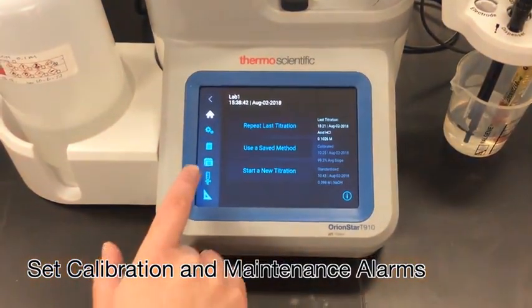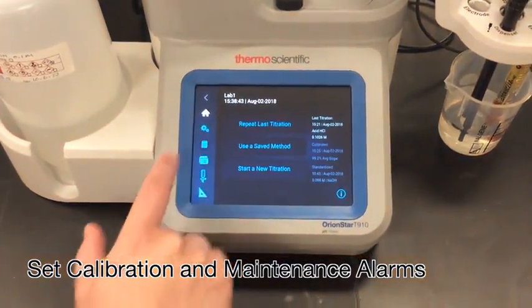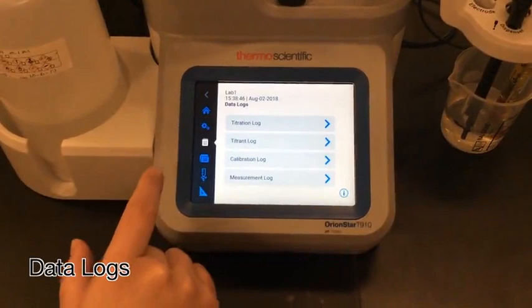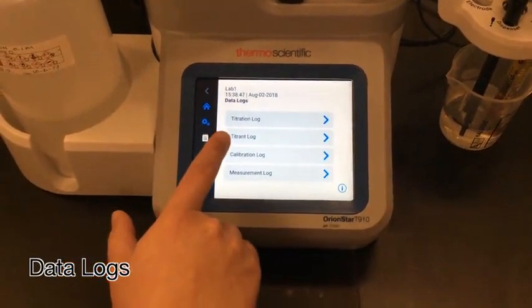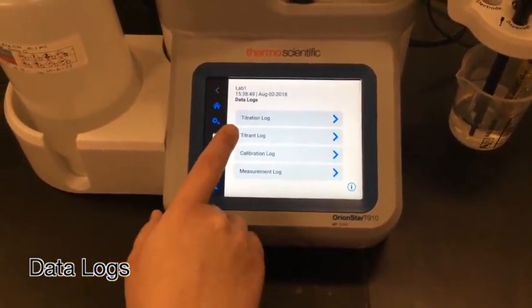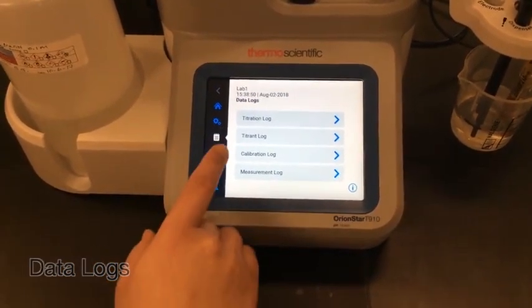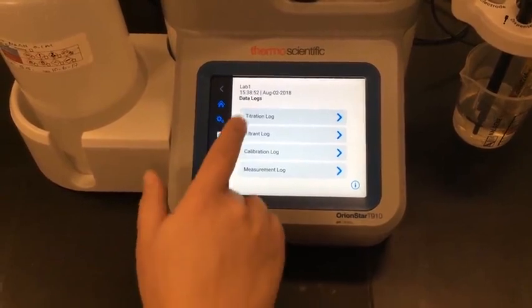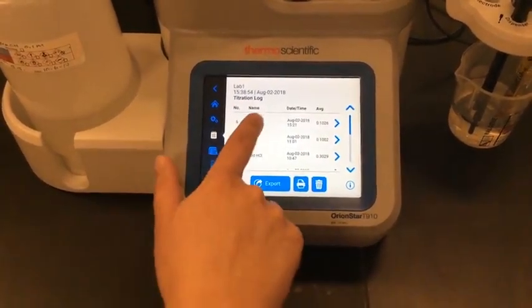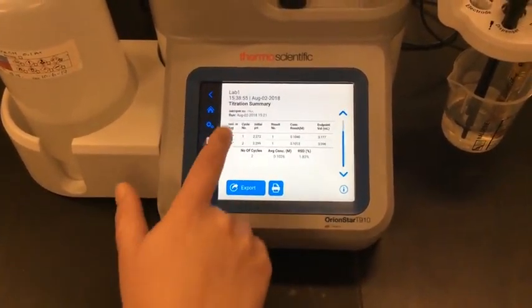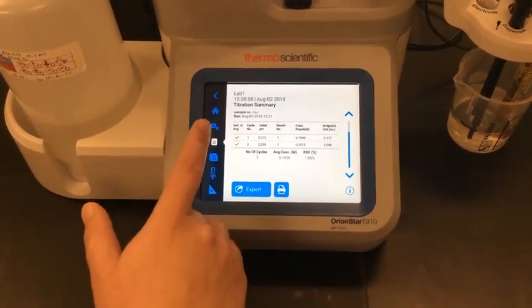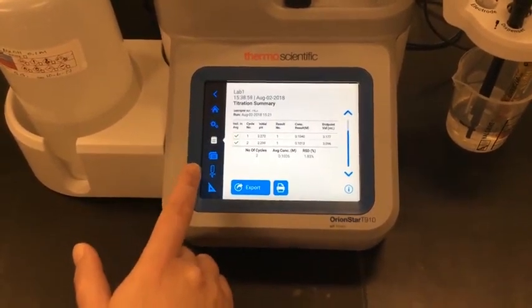The next thing I can go into is my data log. From here I can see my titration, titrant standardization, calibration, and direct measurements. I'm going to go into my titration and take a look at my data — it'll save up to the last hundred datasets.